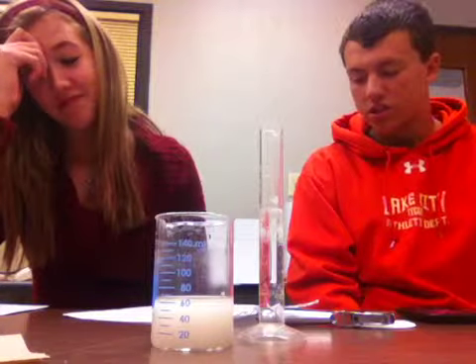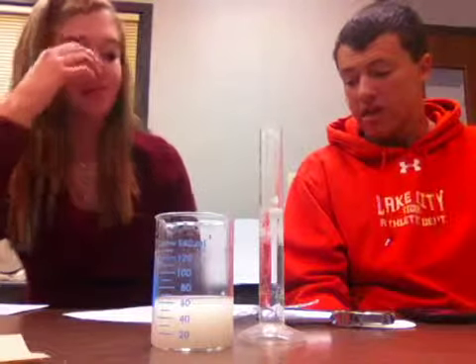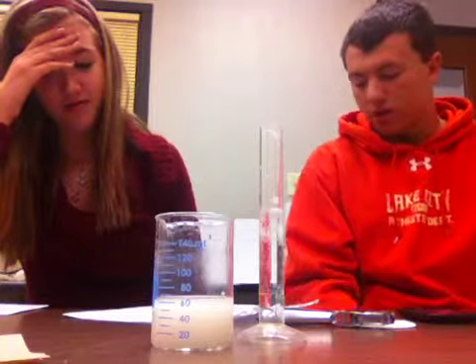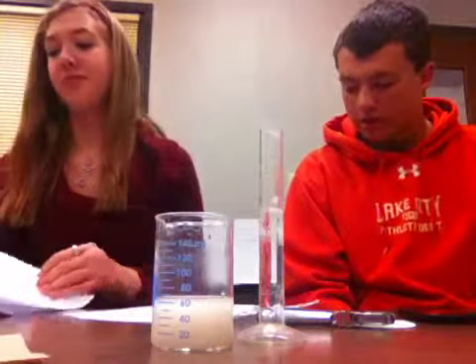Well, basically the conclusion is what have we been? The objective was to see how different concentrations of yeast affected the decomposition rate, and we predicted that more water in the solution would lead to a quicker rate, and the data on the table and the graph, which Lydia will show you.